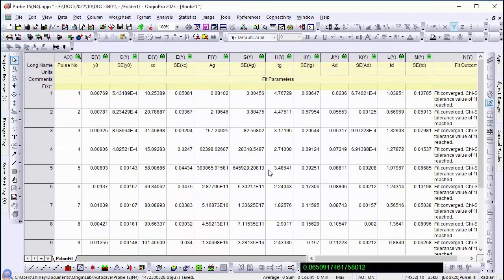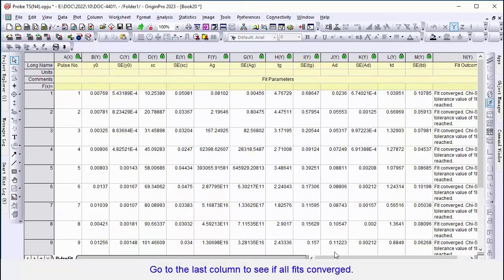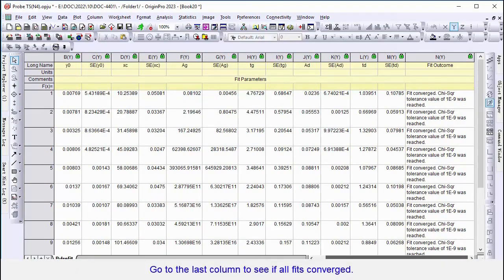First, we can check the last column to see if all the fits converged, and then we can check the parameters.